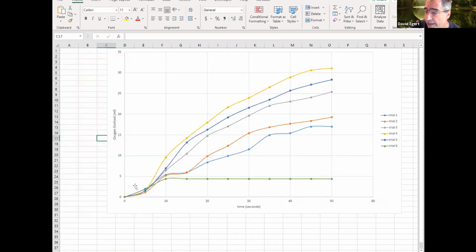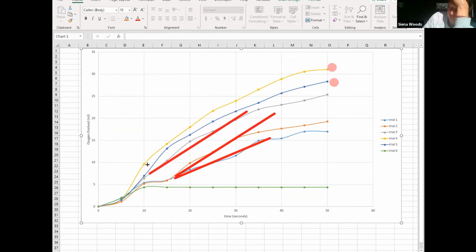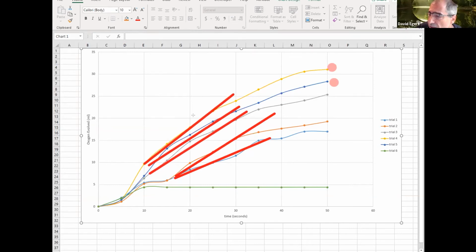If we look at it in terms of the average of everybody's data, we actually see it, except for the total weirdness about trials 4 and 5, right? Trial 5 should be at the top, trial 4 should be here. But aside from that, we actually do see something that looks relatively compelling, where this is getting a little steeper, and then these are looking like they're leveling off. So in general, I do see something that looks like saturation if I'm just eyeballing it.